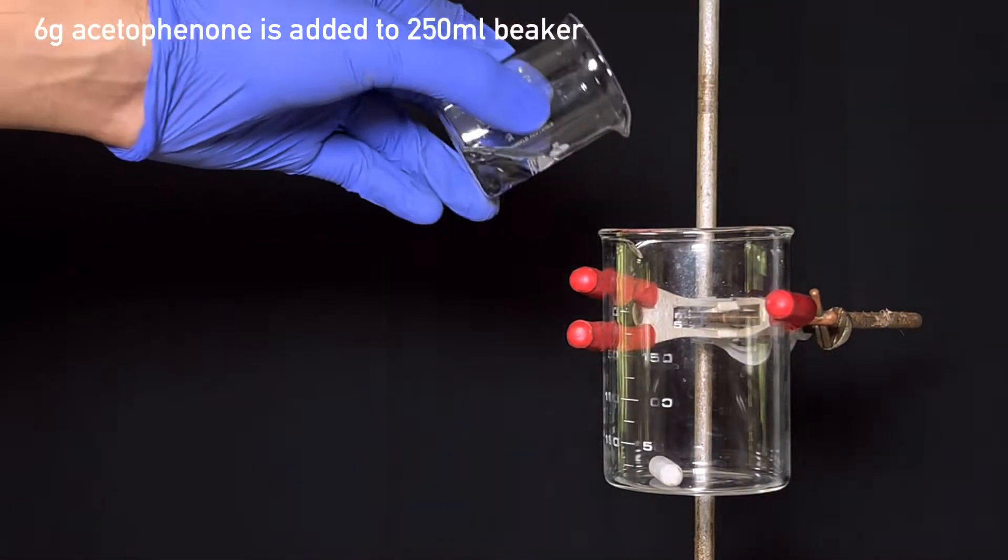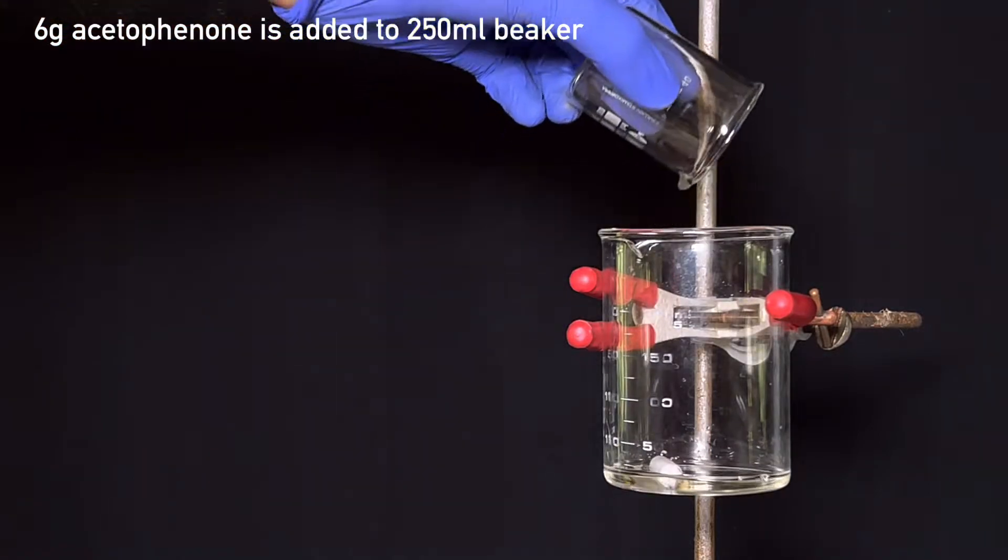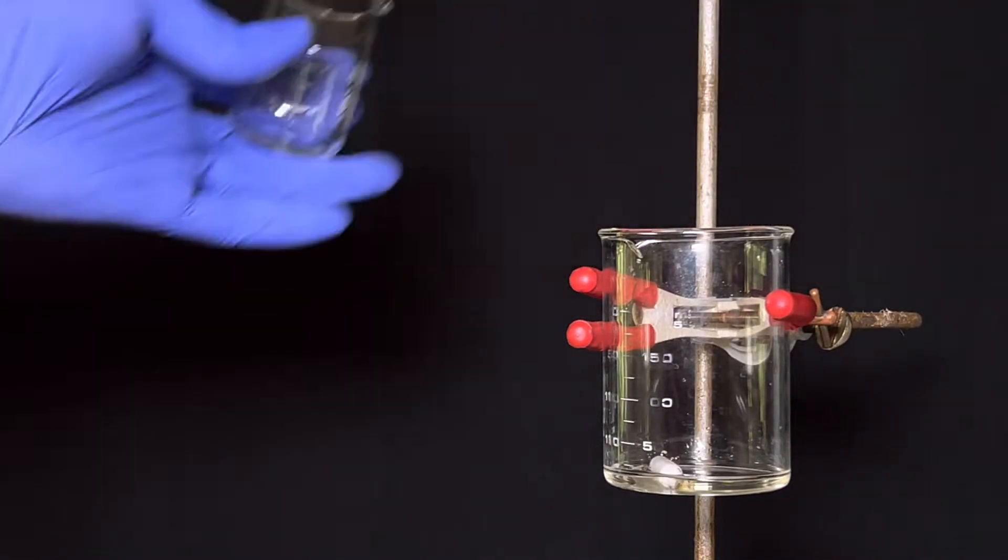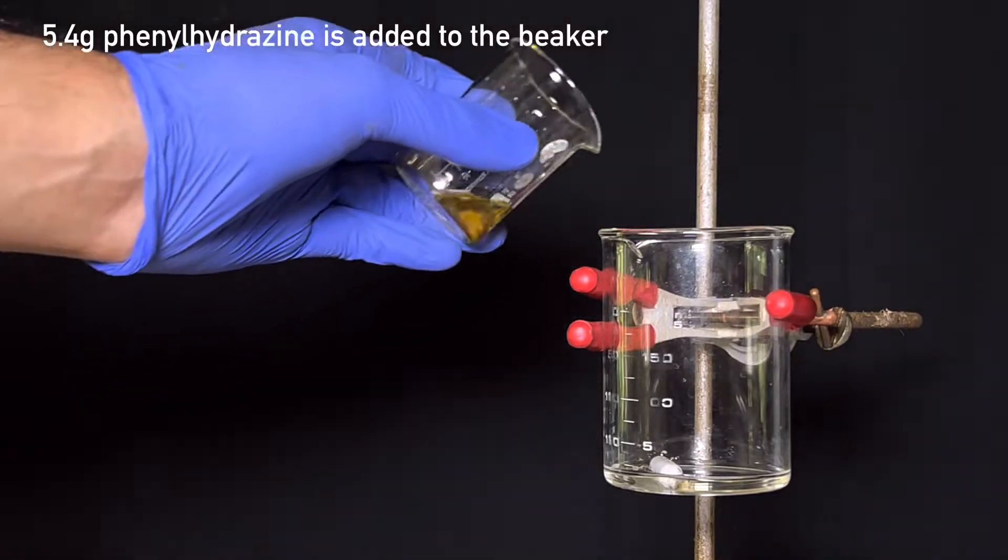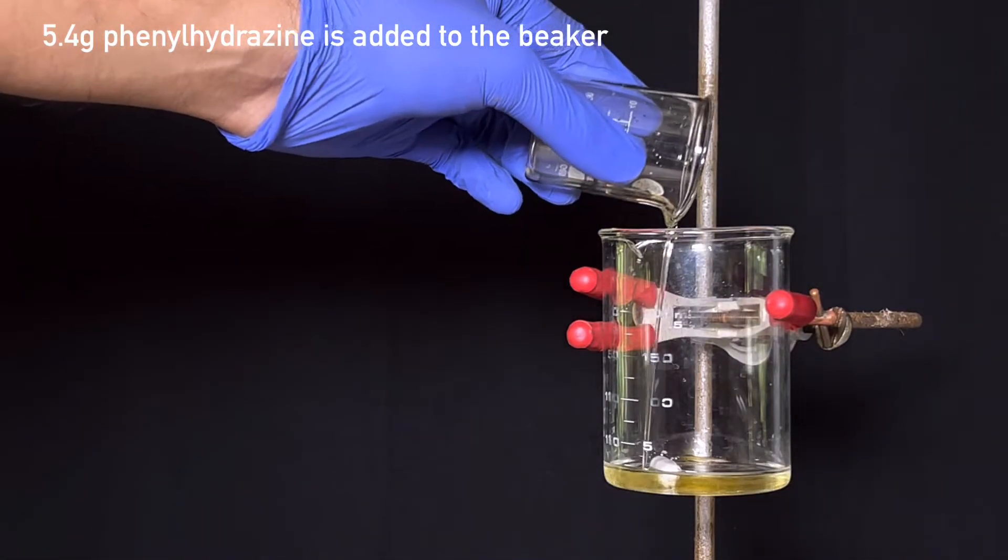Start by taking a 250 milliliter beaker with a stirring bar inside, then add 6 grams of acetophenone to it. Next, 5.4 grams of phenylhydrazine was added to the beaker.